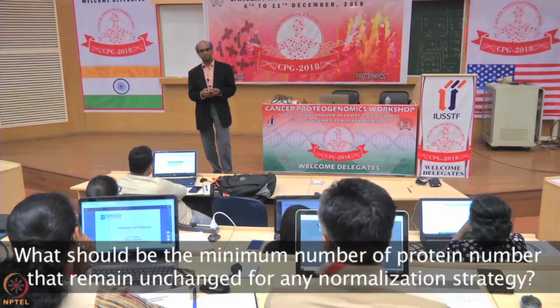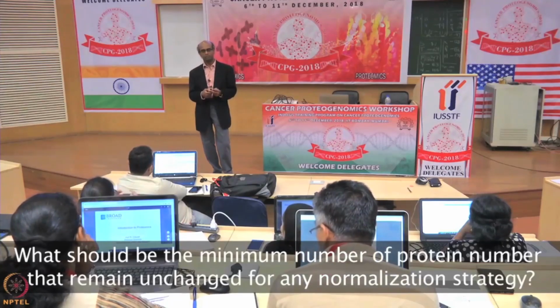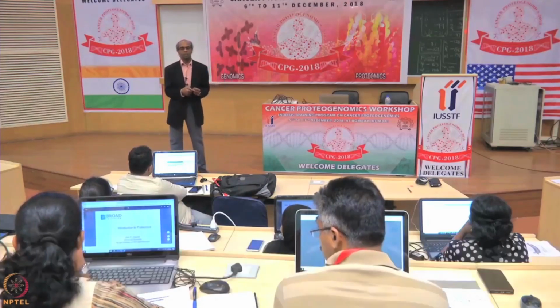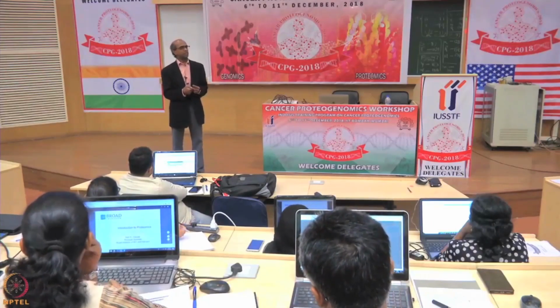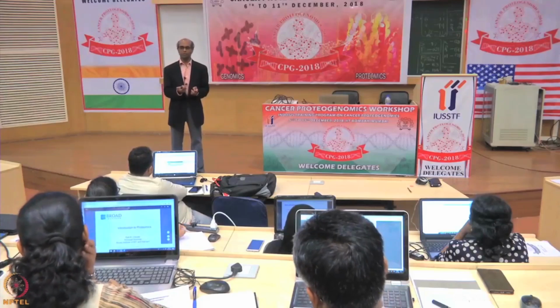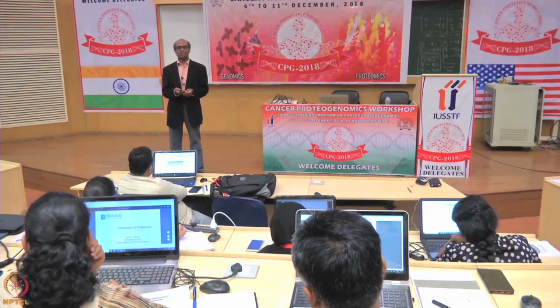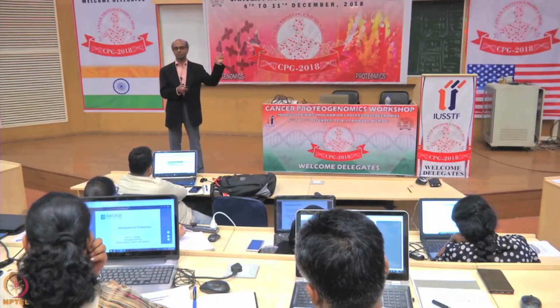Because we are having 3 different clinical conditions, there will be very few proteins which are not changing across all the 3 conditions. So what should be the minimum? Usually my rule of thumb is you should expect there to be at least a few hundred proteins that are not changing. If you have only 5 or 10 or very few in the tens, then it's not a good method to apply.